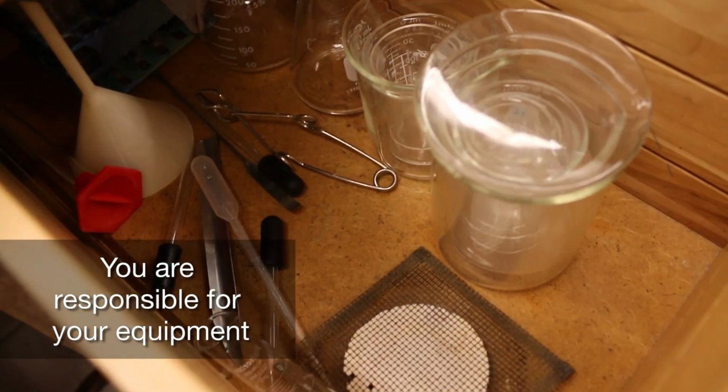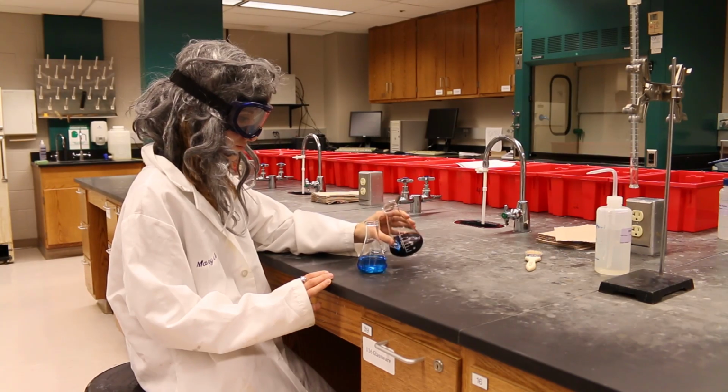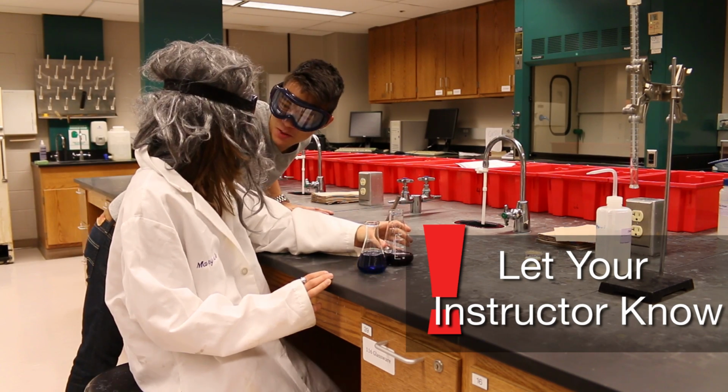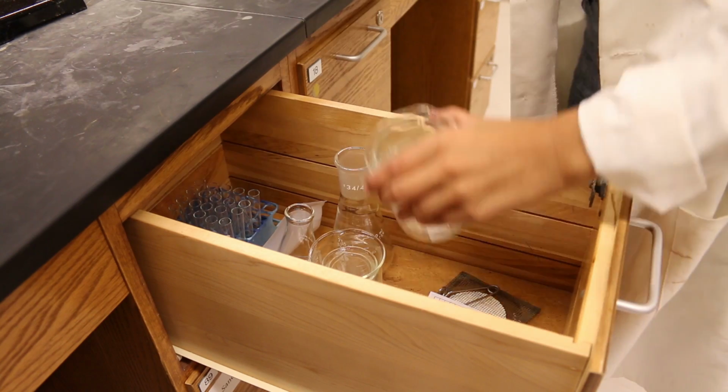You are responsible for all of the equipment in your drawer or bin and any equipment you use from the common bench. If it is dirty when you first get to lab, make sure you let your lab instructor know. It is your responsibility to make sure all of it is clean when you leave the lab.